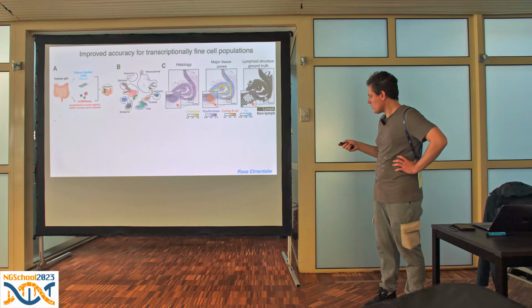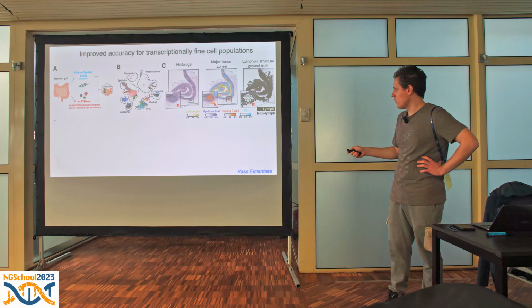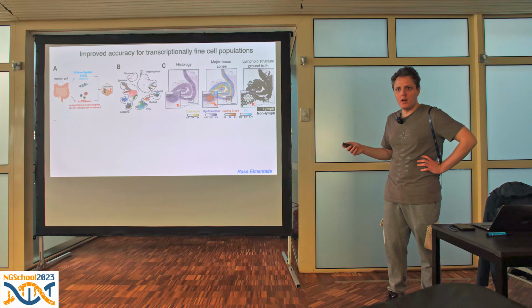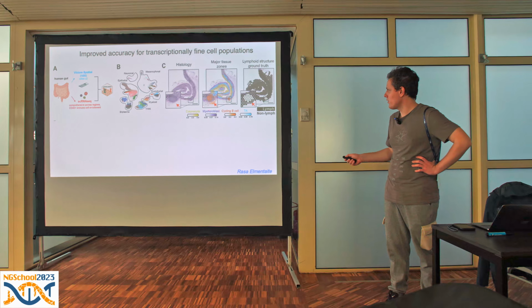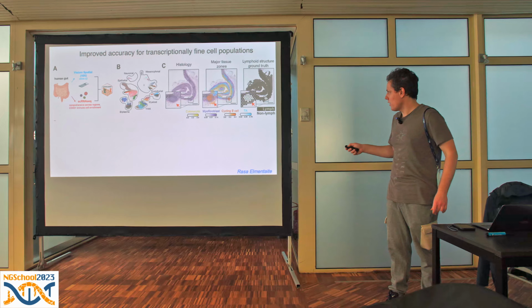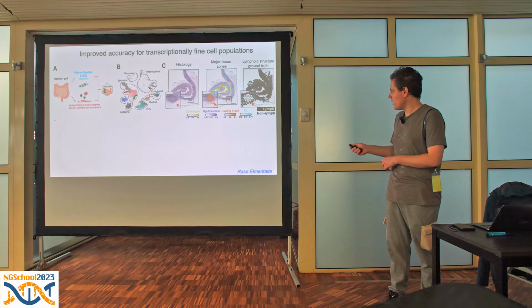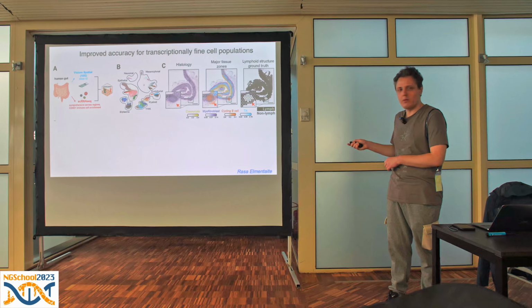Because Visium is a technology paired with histology images, we can use the histology image to annotate where these lymphoid regions are. The first thing that we looked at is, if we do spatial mapping of all of these cell types and we map them at the granularity shown in color, not in these outlines, we see cell types that define major tissue zones, especially the gradient of differentiation in the epithelial layer. This means that overall the analysis worked, but now we want to systematically assess whether lymphoid immune cells indeed map to the lymphoid structure.